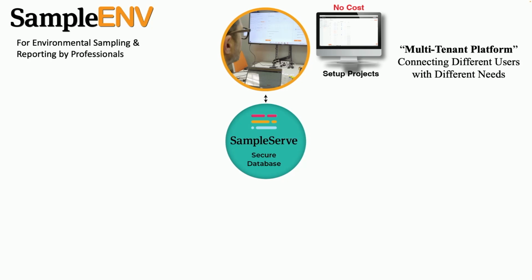Welcome to the SampleServe SampleENV platform overview. The SampleENV platform is a multi-tenant platform. That means that there are different components that serve different connected users, each with their own data needs. For instance, a lab technician has different needs and uses than a field sampling technician does.